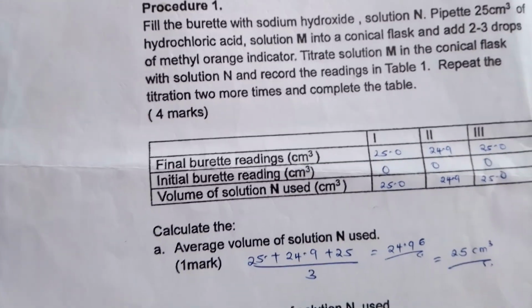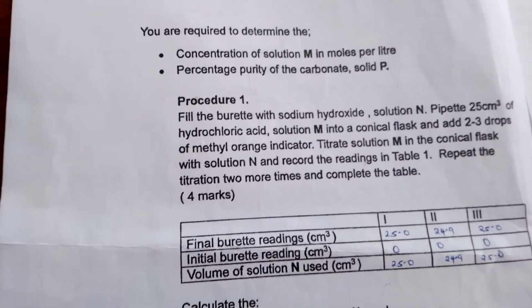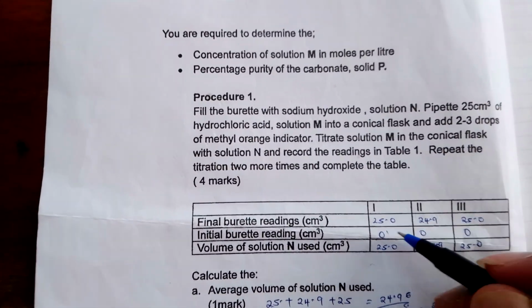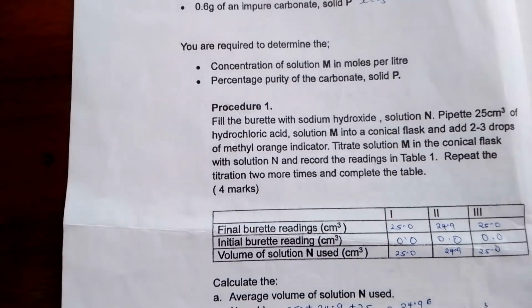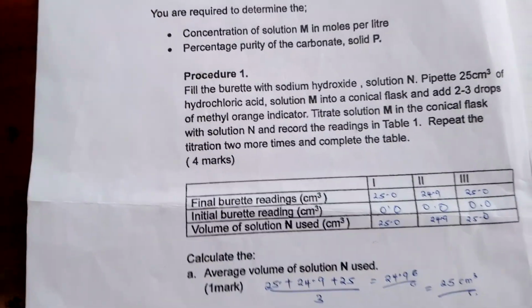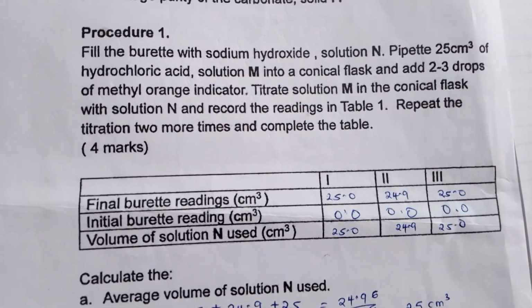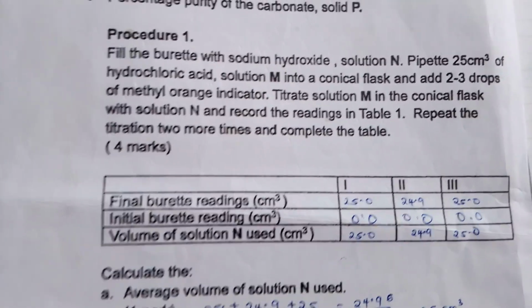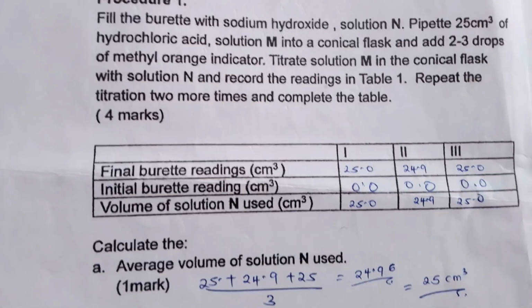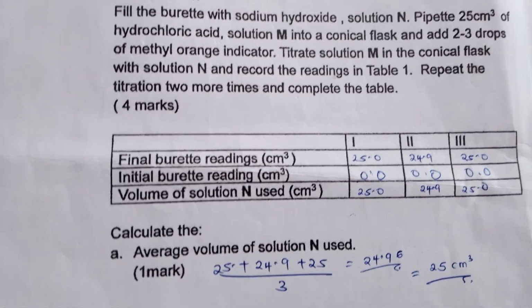So this is the table that you are supposed to complete. Let me just show you. Let me put it how it's supposed to be. It's supposed to have at least 1 decimal point. So we did the entire practical and we found the figures that you can see on the table. And then we went ahead and calculated the average volume of that solution N.